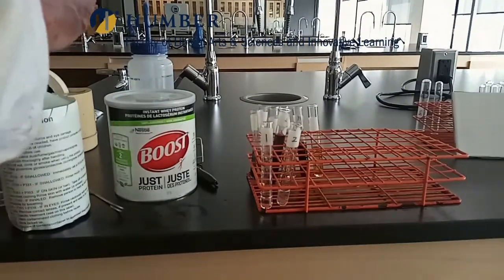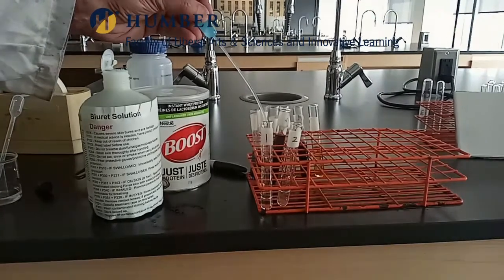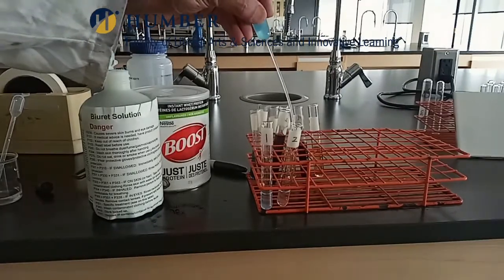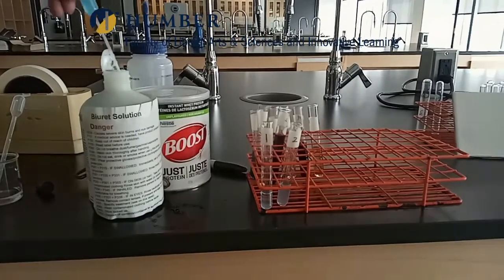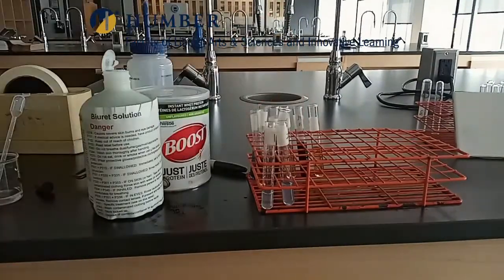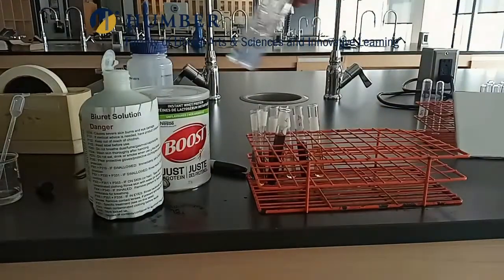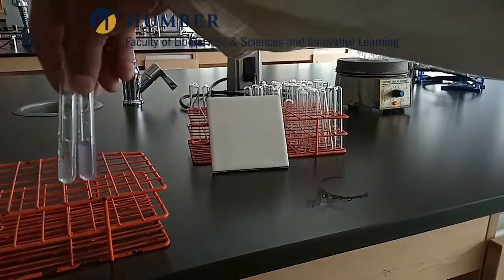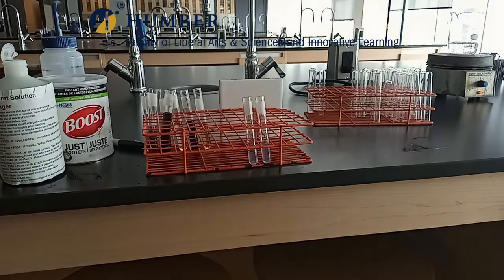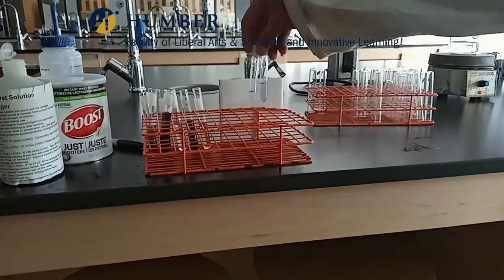Just going to add 4 drops of biuret. Test tube 2 contains protein as well, and test tube 1 was only distilled water. And record your observations.